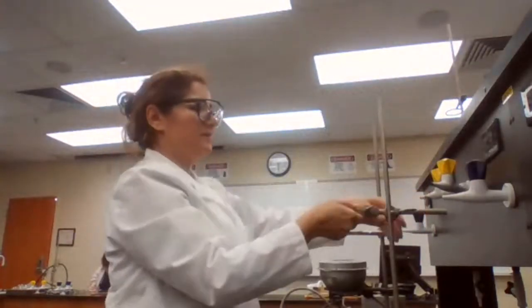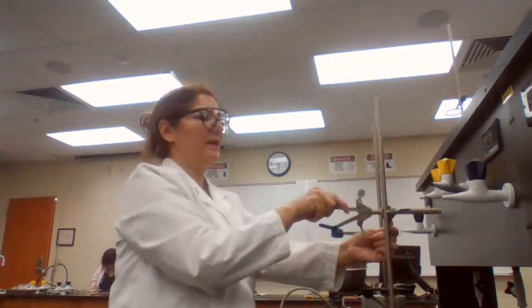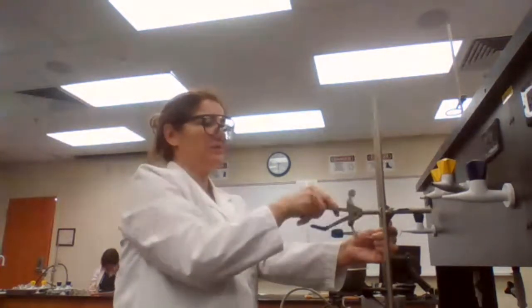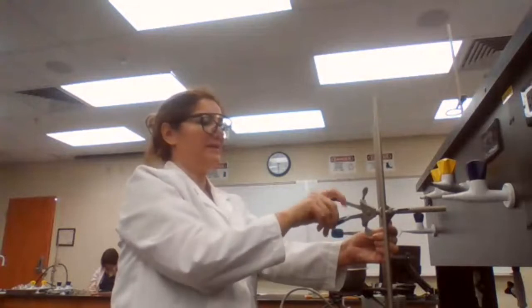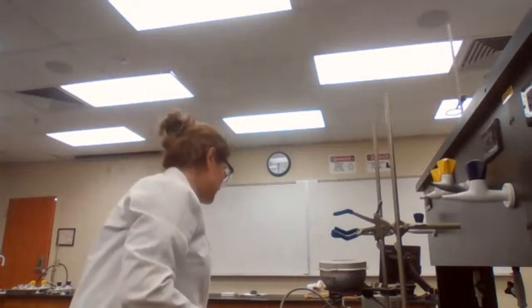The good thing about this 3-finger clamp is that the angle and the arm length are adjustable, so you can have a better setup for your condenser. So if you have your hardware set and then you bring the glassware, the chance for lab breakage is lower.